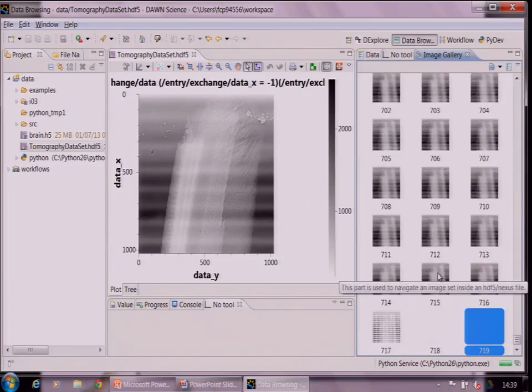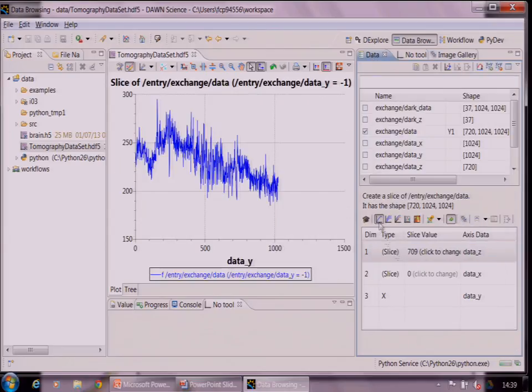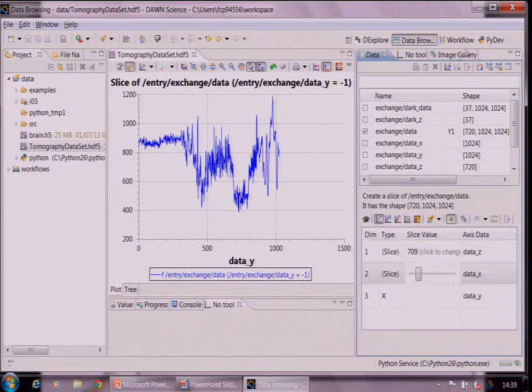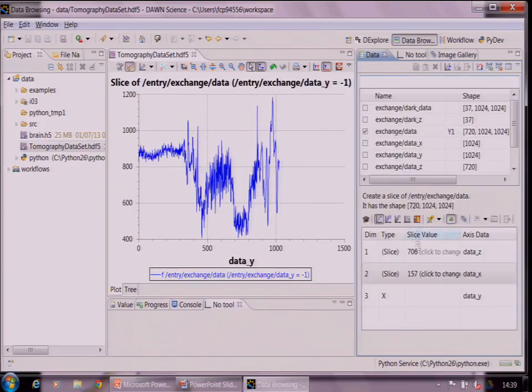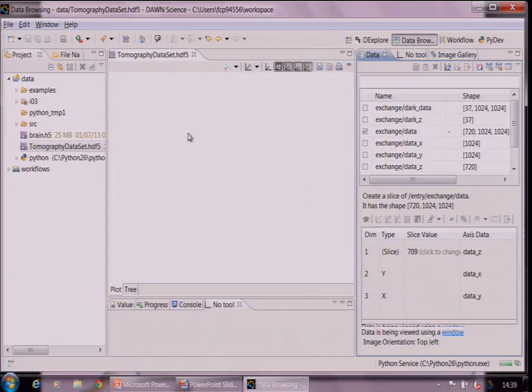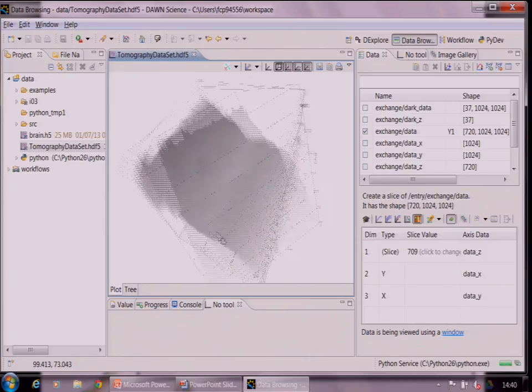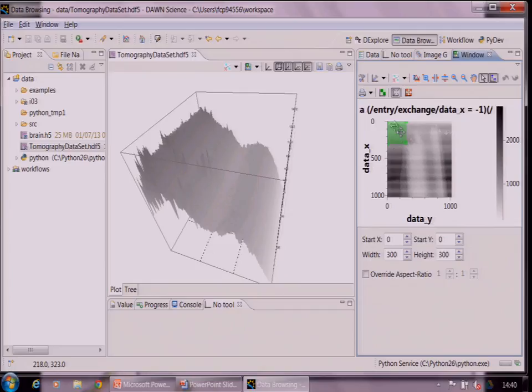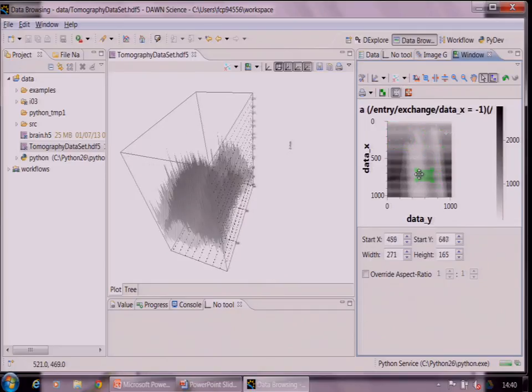This is where we use the lazy viewer stuff, and we can visualize those. We can also do 1D slices, and those can be visualized in the gallery as well. There's also the concept of surfaces, which uses JOGL, Java OpenGL, but we're trying to move to JavaFX in the future. So here we can go over the image and look at it in 3D.